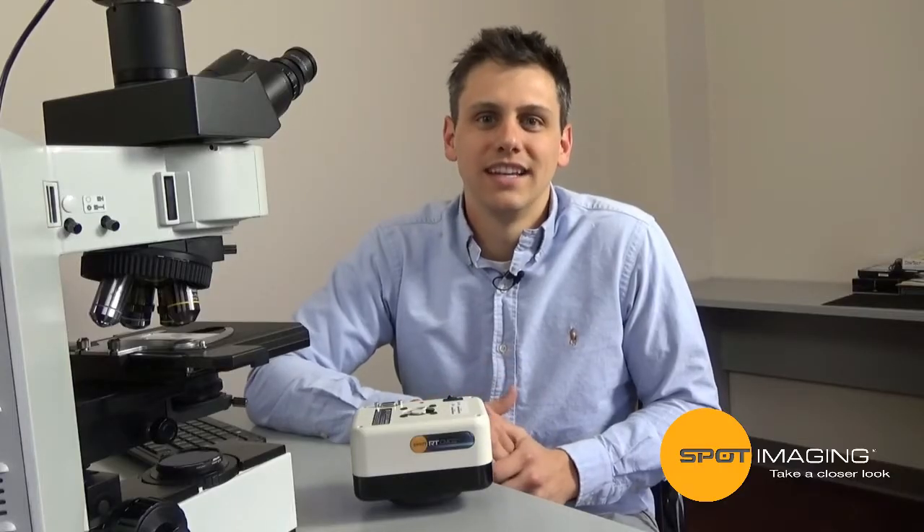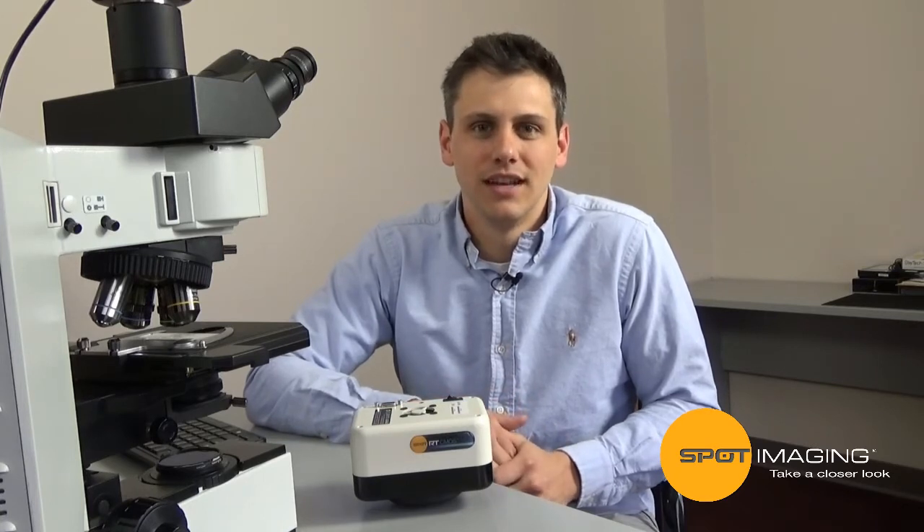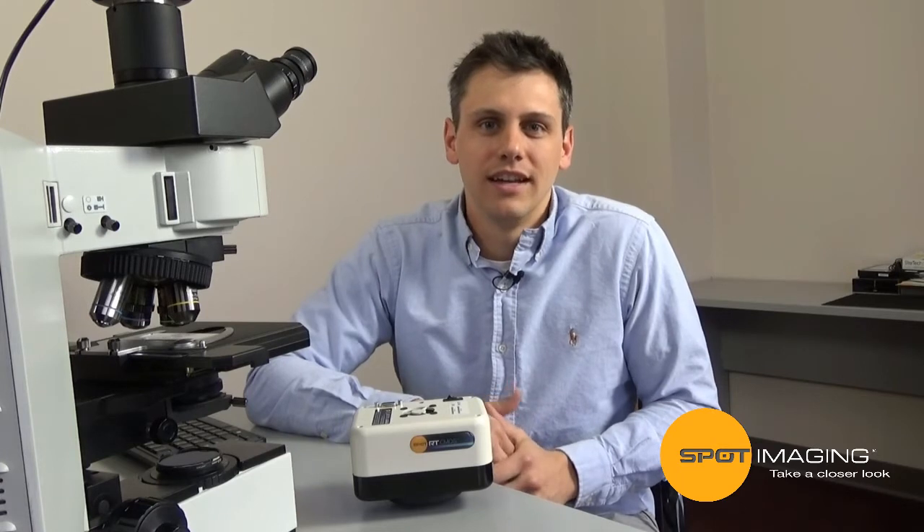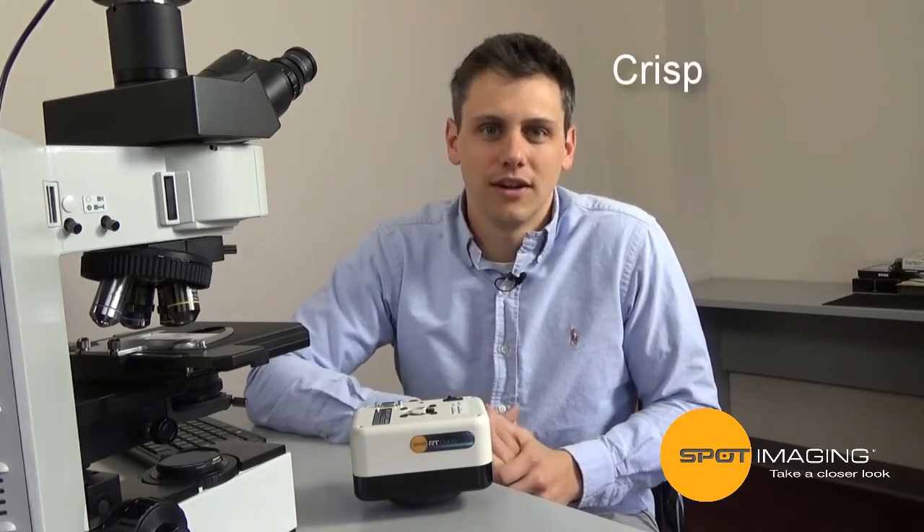Previous high-speed cameras either cost a fortune or dumped a load of noise into your images. The Spot RTS CMOS camera sacrifices neither — it provides crisp, clean, long exposures at a fraction of the cost.